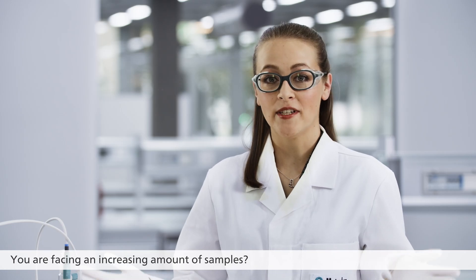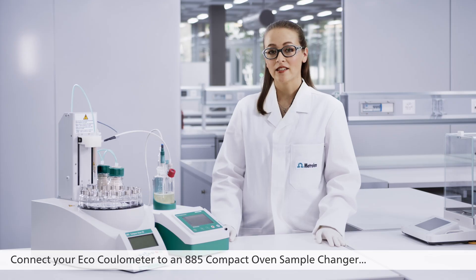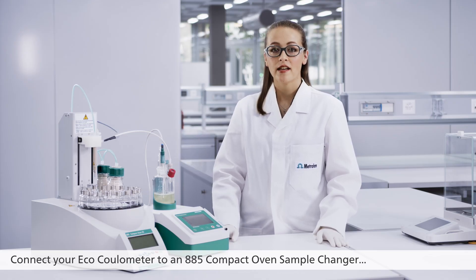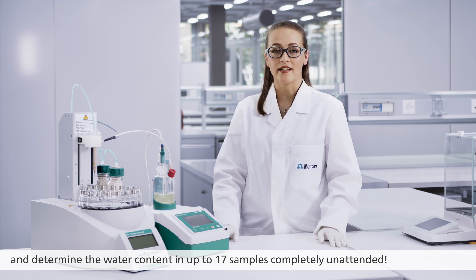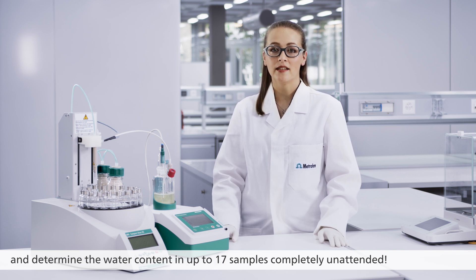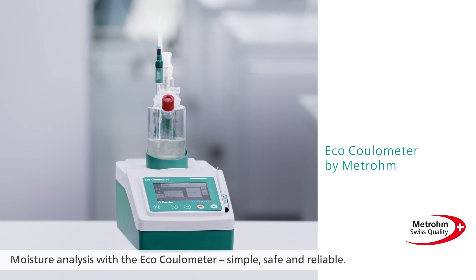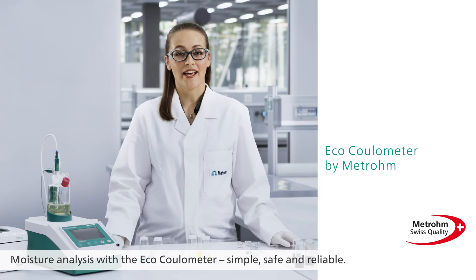You are facing an increasing amount of samples? Connect your Eco Coulometer to an 885 compact oven sample changer and determine the water content in up to 17 samples completely unattended. Moisture analysis with the Eco Coulometer: simple, safe and reliable.